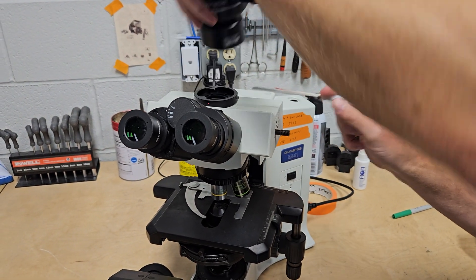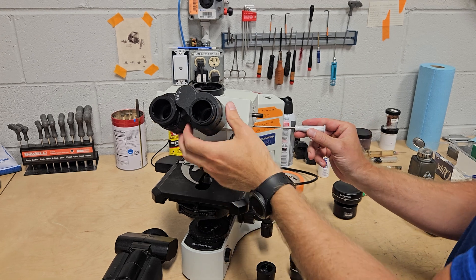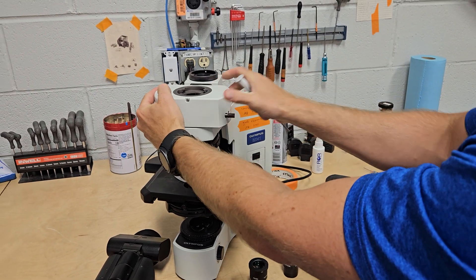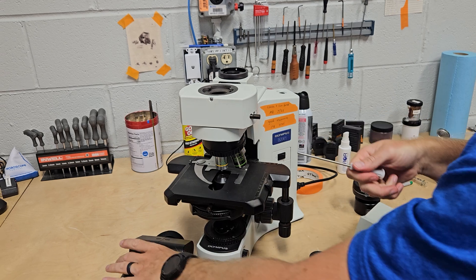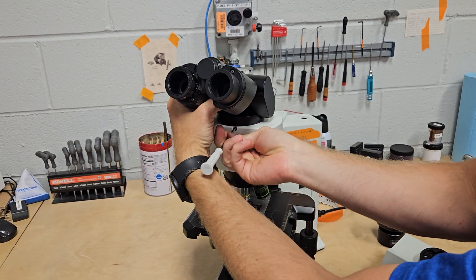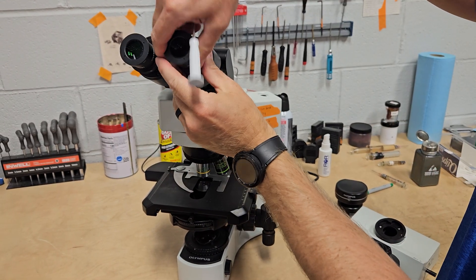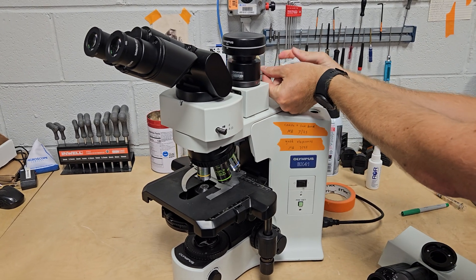There's another way — I like the trinocular head, but you kind of lose some ergonomics. It can be uncomfortable if you're not exactly the right height or don't have a lifting desk. Another way that I really like is to use the U-True port. These are awesome because you get to keep all of your ergonomics and it'll work with every head that Olympus makes, or most. You put the eyepieces in, put your camera adapter here, and then lock it in with the single screw.